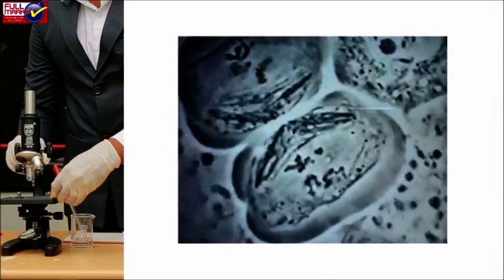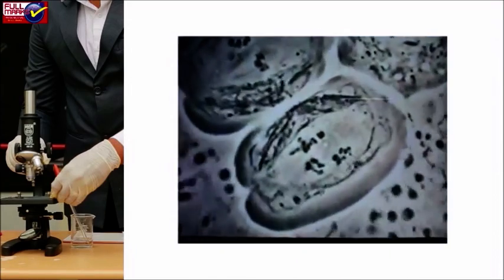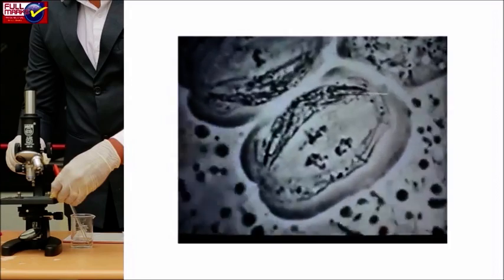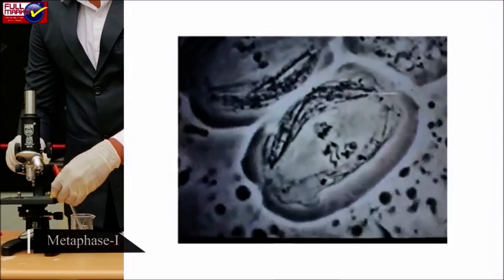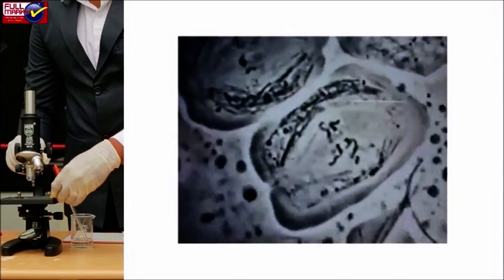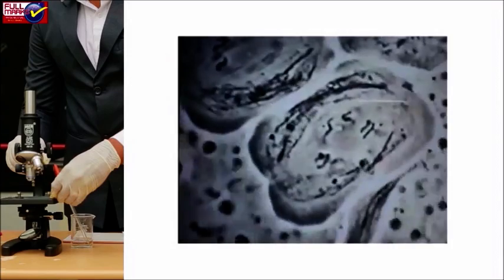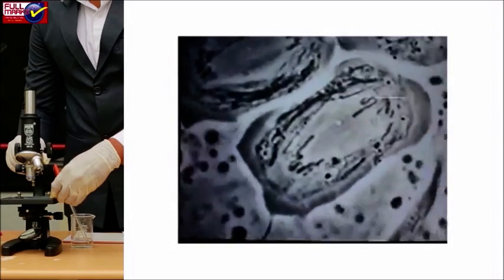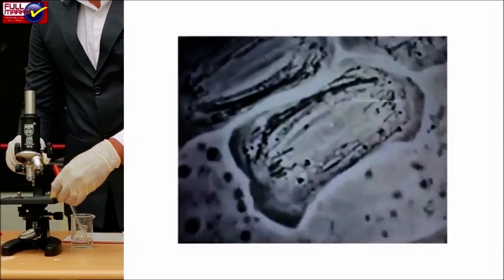Metaphase I: The bivalents orient themselves at random on the equatorial plate. The centromere of each chromosome of the terminalized tetrad is directed towards the opposite poles. The chromosomal microtubular spindle fibers remain attached with the centromere, and homologous chromosomes are ready to separate.